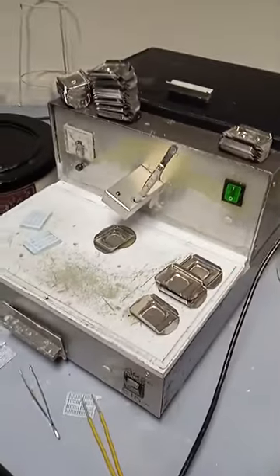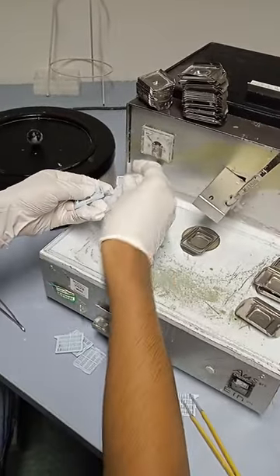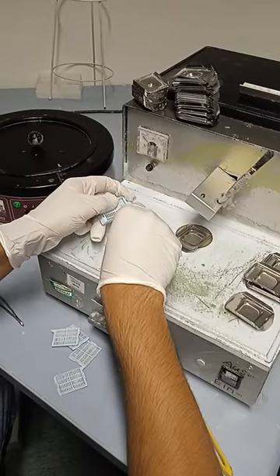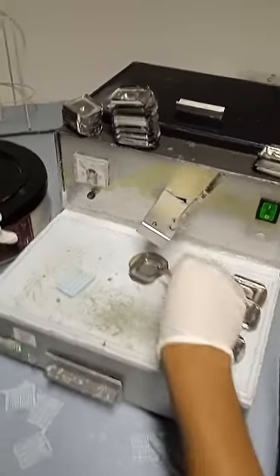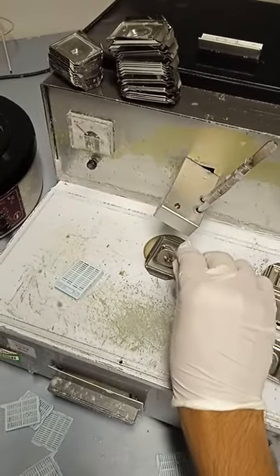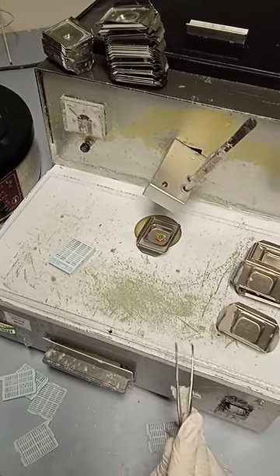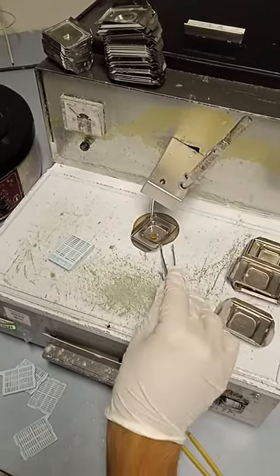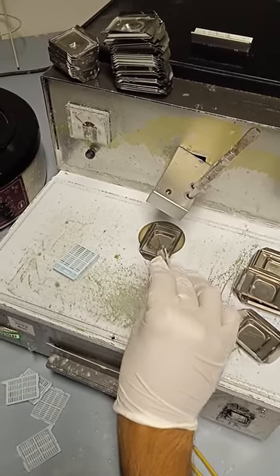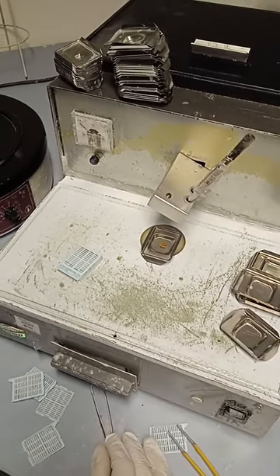Afterwards, you will remove the upper part of the cassette and then put your tissue in the middle of this container. Then you will drop some liquid paraffin — I already have some paraffin liquid from before — just drop it in the middle.